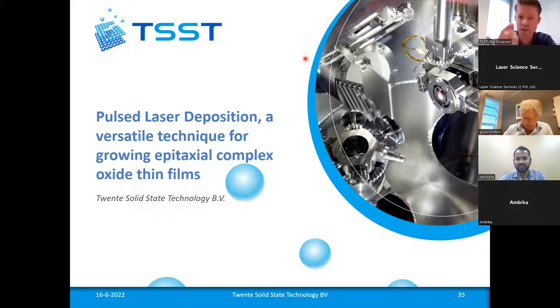So you can set your scan area. The engineering solutions are there. It's a definitely important remark, and you need to prevent the drilling. Basically, we can use all parts of the target. Yes, I would put it that way. And there are targets thinkable that are quite expensive, where you want just a small piece or a quick run. You could even ablate from substrates, arguably single crystal. So the scanning approach gives you more flexibility. And again, for your vacuum conditions it's cleaner, since there are no moving parts inside the vacuum. And the whole carousel, the targets can be exchanged.